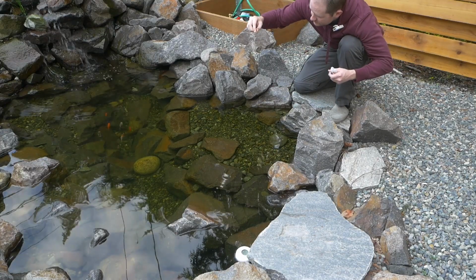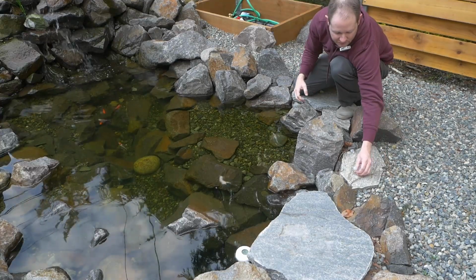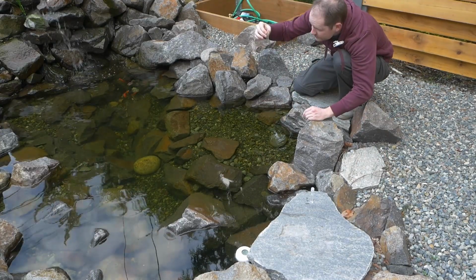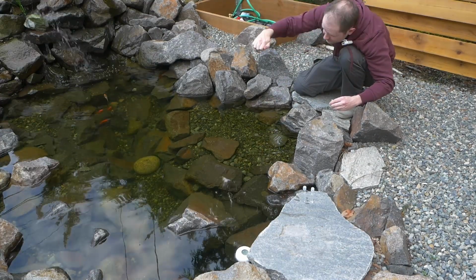So right here, I'm going to go ahead and fill each of the 4 vials to the 5 milliliter mark. Don't worry, not much guesswork here. The proper fill line is marked on each. Getting just the right amount can be a little tricky though.